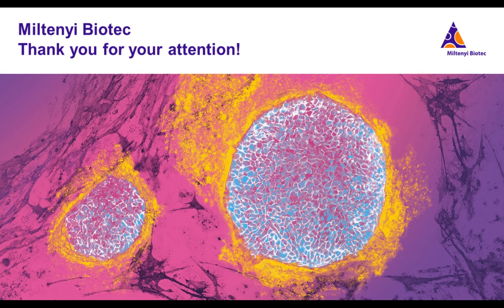So yes, you can see them, but you have to be careful if you would like to visualize soluble factors. Make sure that you are using a fixation method which is cross-linking these molecules. You should not use acetone fixation, for example, for those factors, but rather PFA, for example, or FFPE, and then you can definitely image those markers.